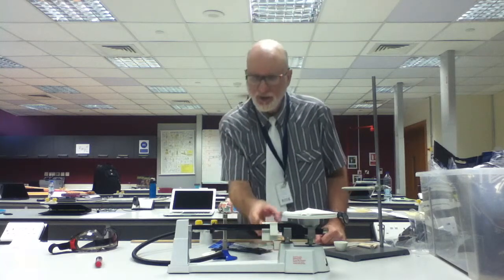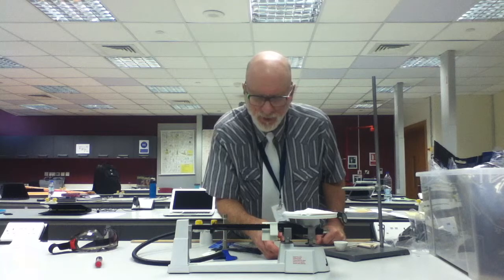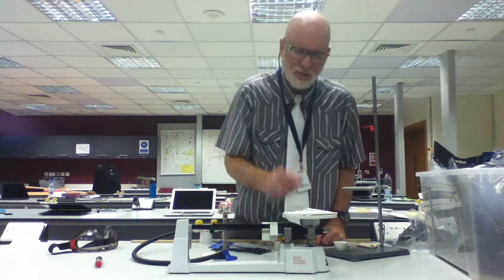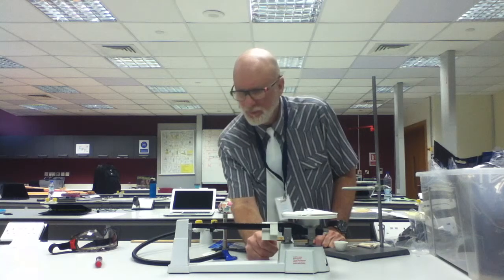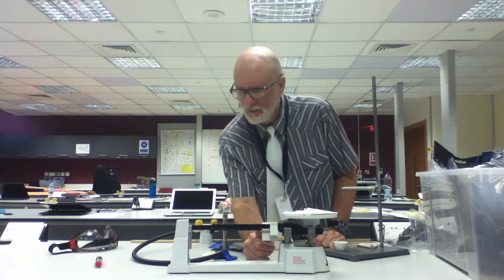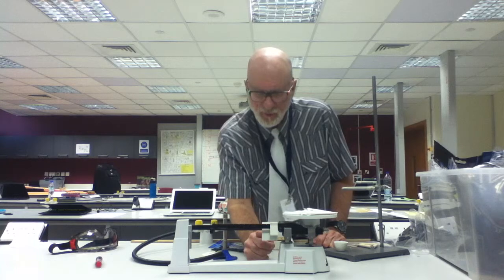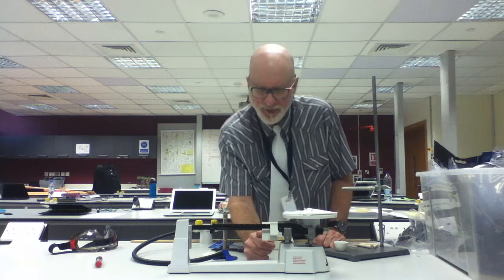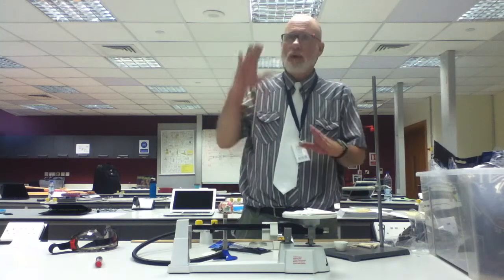Then you write the mass down. I got the mass to be 1.20. It's only going to go up a little bit, so you've got to get it back down to the 0.60. Clear? You write those masses down.